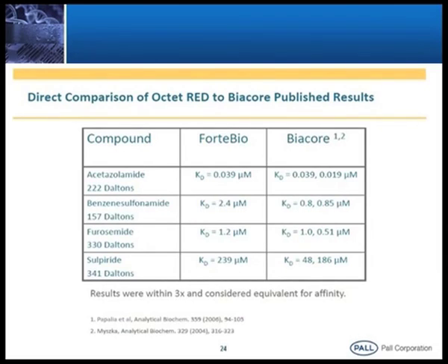This is a small molecule. These are the carbonic anhydrase inhibitors. So carbonic anhydrase was immobilized onto a sensor, and then these drug inhibitors were passed over it. These are on par with the results. This is also once again a publication by Myszka.